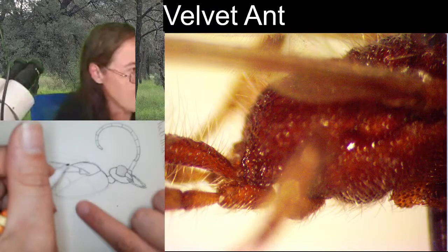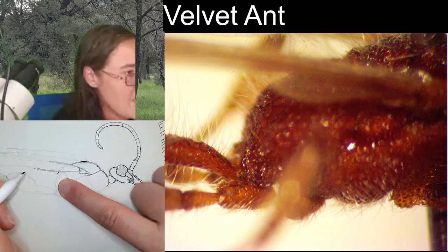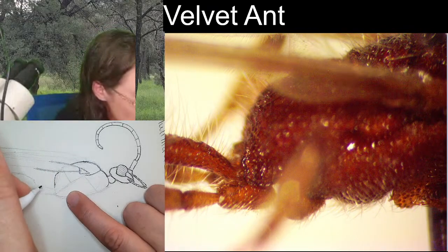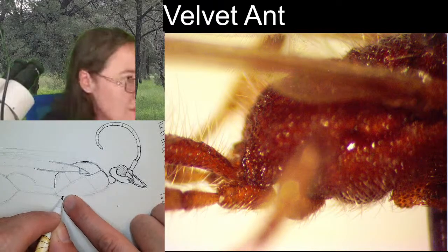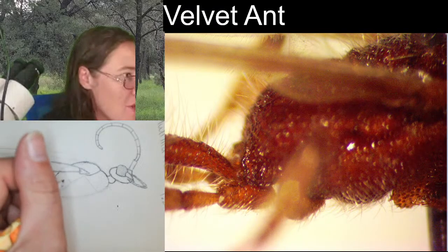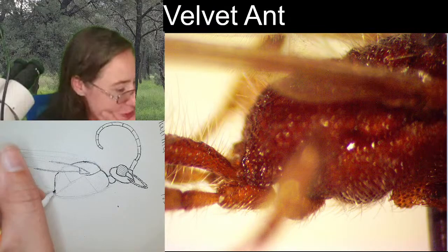Alright, so it is angling itself down, but then once it gets right around here, we have a sharper decline. And you can see this is where, right around here, that second pair of legs are connected. And then the third pair of legs are right there, right at that wasp waist. Check that out. All right, so we've got this taken care of.